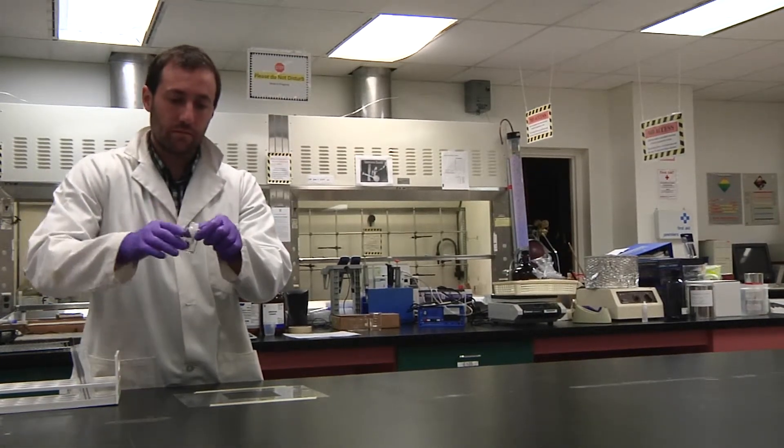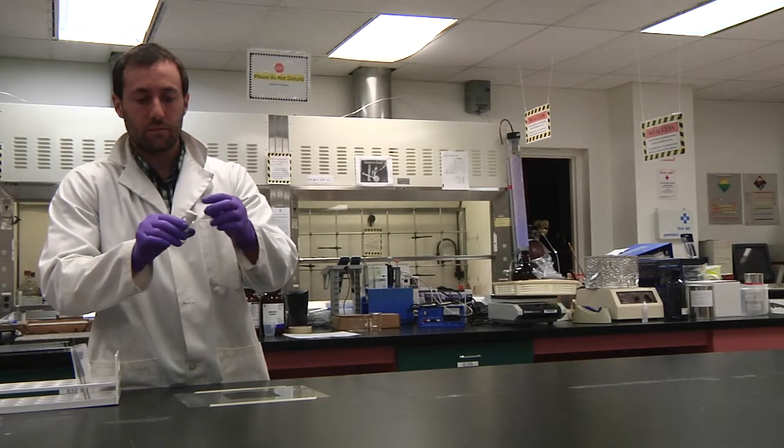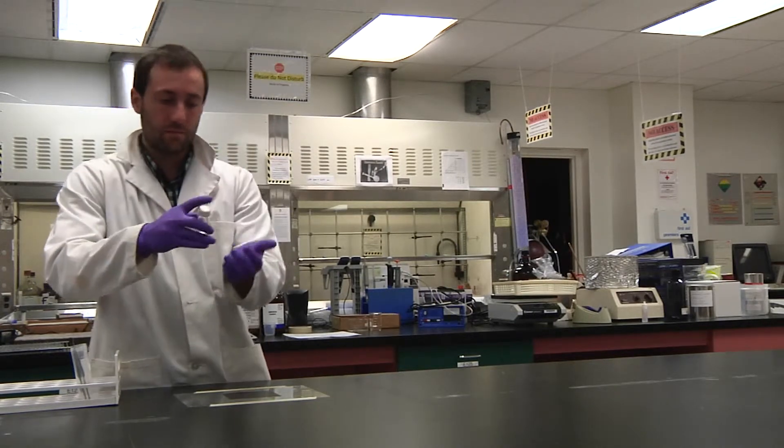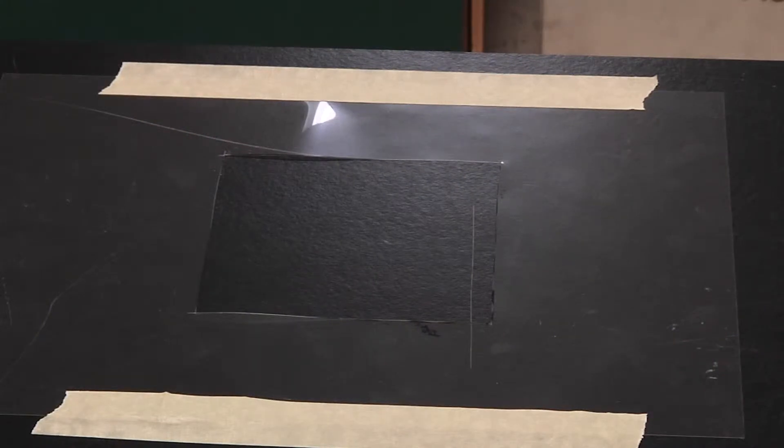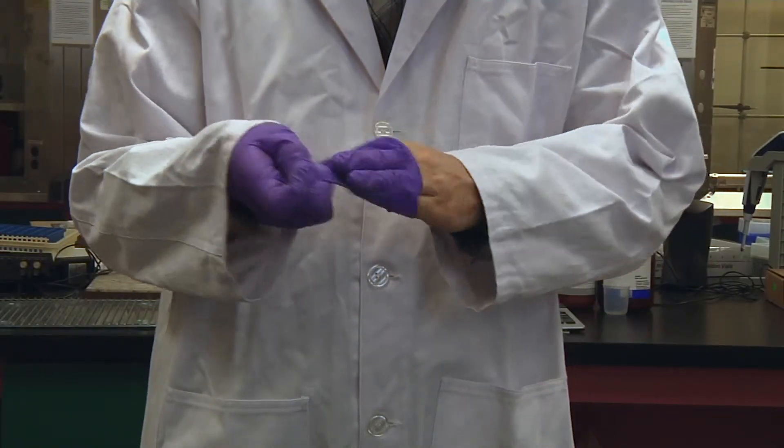Roll or fold the wipe so that it can easily fit back into the sample vial. Insert it and cap the vial. The surface should look dry with no residual solvent or particulate. Dispose of your gloves before moving on.